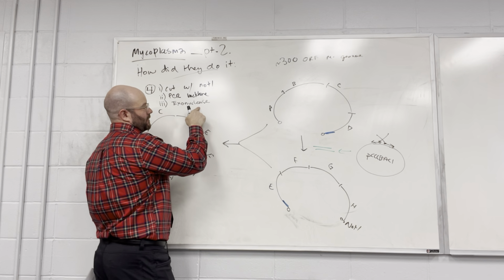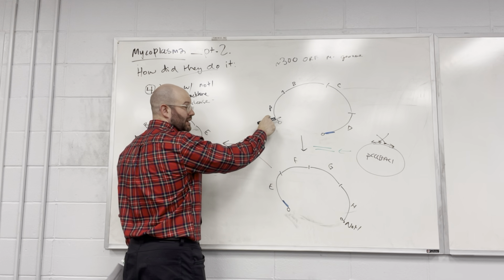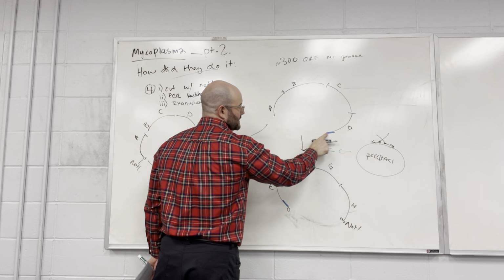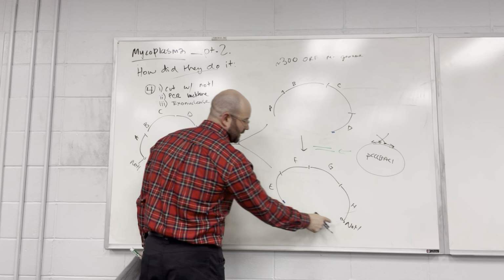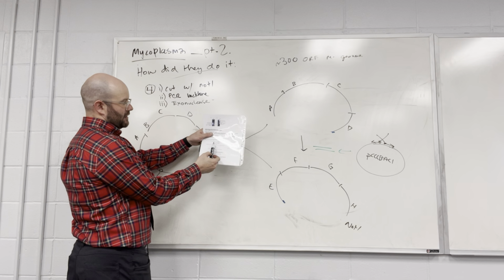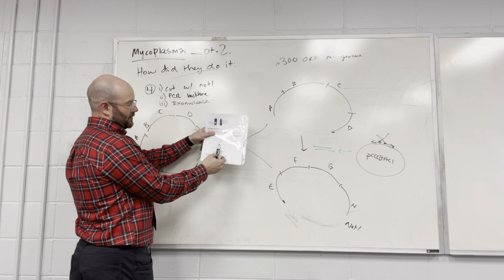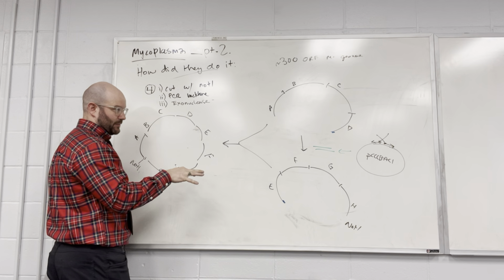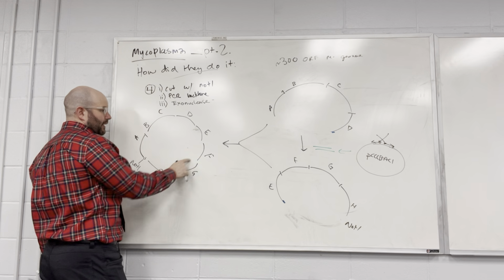When the exonuclease, I don't know if it's T5, is chewing back these sides, it messes with the NotI site and removes it. So now these NotI sites are removed. That's what this figure is showing. Here they have NotI, and after it chews in, it's removing the other part of that NotI site, which gets rid of the NotI site. And then it comes together, okay?